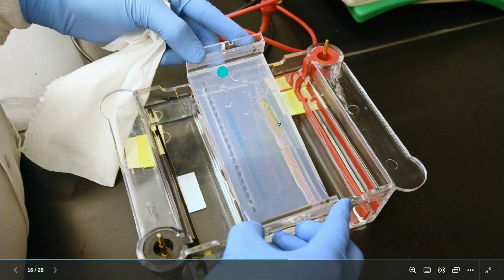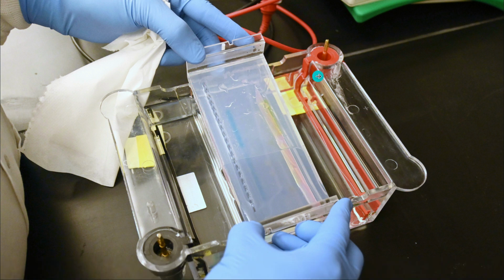We create agarose gel by dissolving 0.7% of agarose, and this agarose is placed into a chamber, and we create wells. Here you can see the different wells using a comb. Once these wells are created, we place this into the electrophoretic unit, which is filled with buffer.